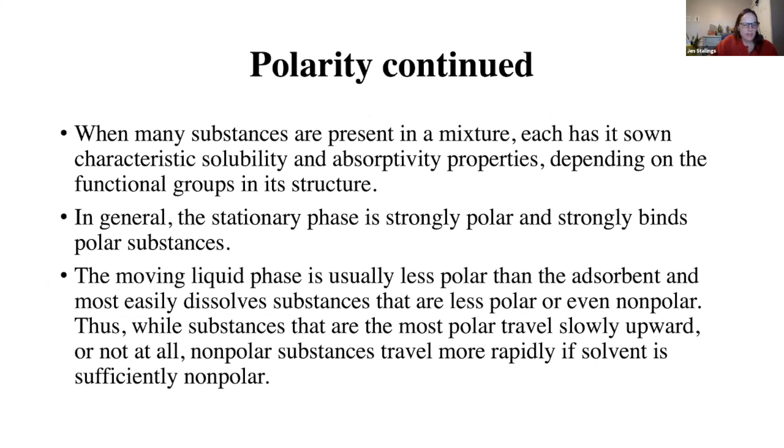Okay, let me skim through this. In general, the stationary phase, your silica gel, the part of your TLC that's standing still, is strongly polar, so it's binding to your polar substances. The moving liquid phase is usually less polar, aka non-polar, like our hexanes. Those are going to dissolve substances that are less polar or non-polar.